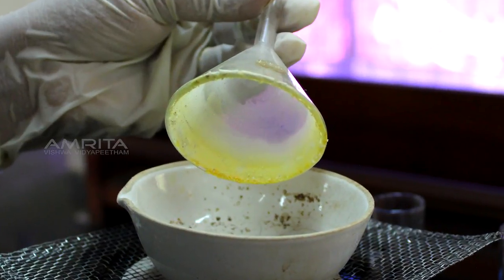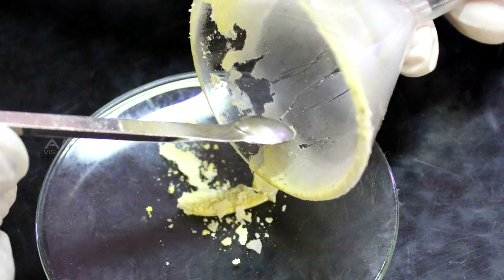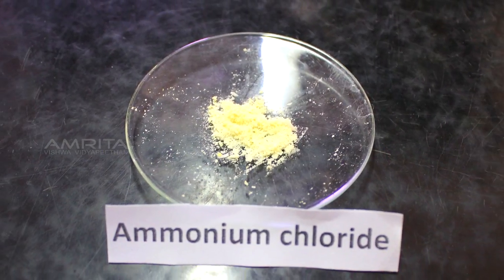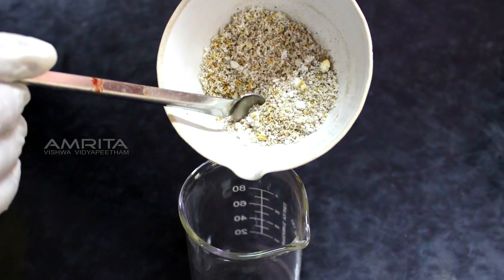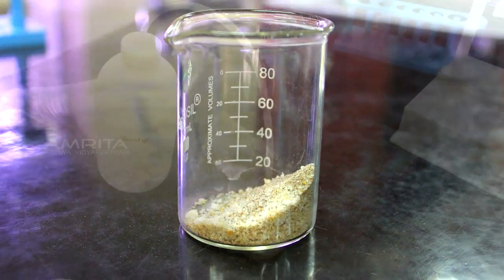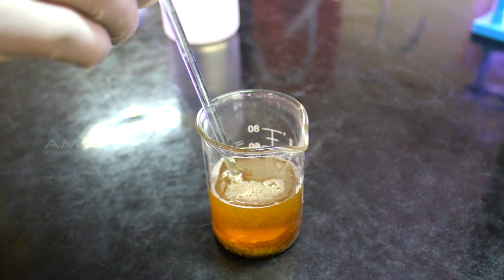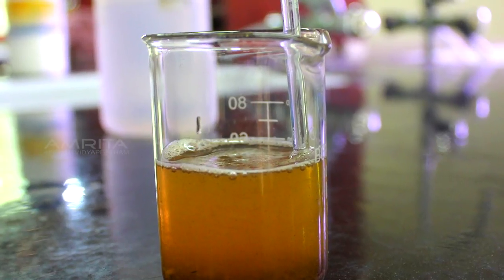Remove the solid ammonium chloride sticking on the walls of the glass funnel using a spatula and transfer it into a watch glass. Using a spatula, transfer the mixture from the china dish into a beaker. Then pour some distilled water into it and stir the contents of the beaker with a glass rod.